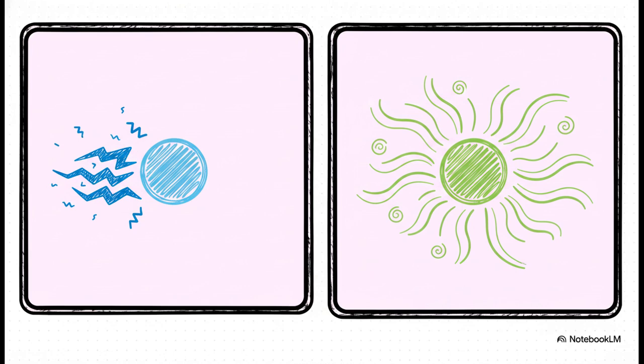Let's actually break down those two distinct phases. On one side, we have the excitation phase. Here, our fluorophores absorb short-wavelength, high-energy photons, typically ultraviolet or an intense blue light. This energizes, or excites, the molecules. Then comes the emission phase. As those excited molecules finally relax, they release that trapped energy as long-wavelength, lower-energy visible light. Essentially, you put invisible, high-intensity short waves in, and you get these beautiful, visible, glowing long waves out.